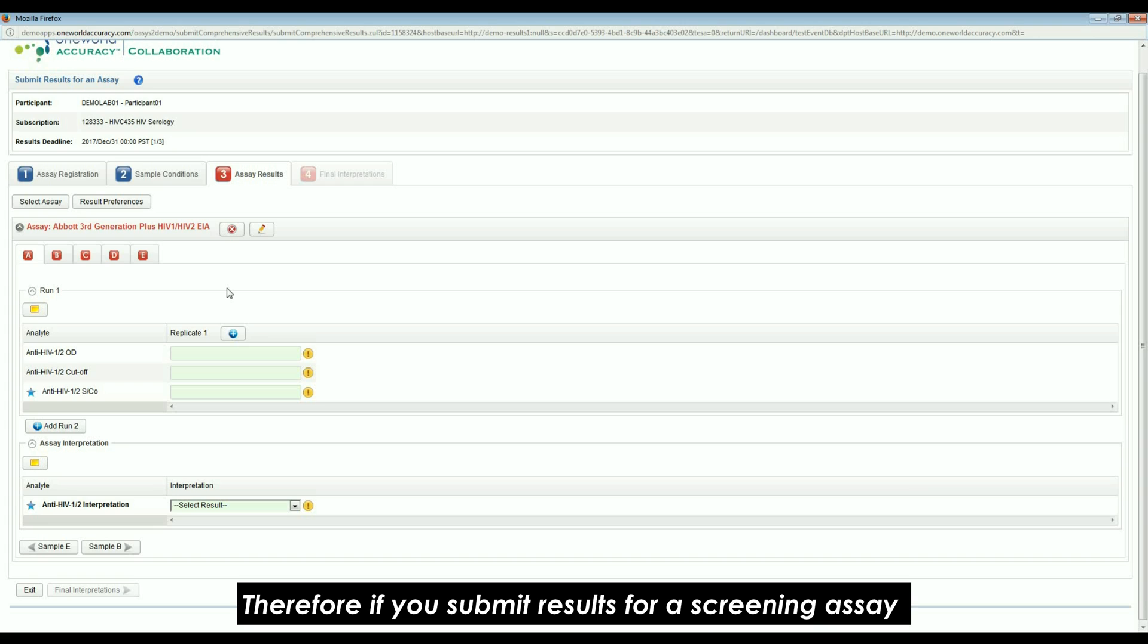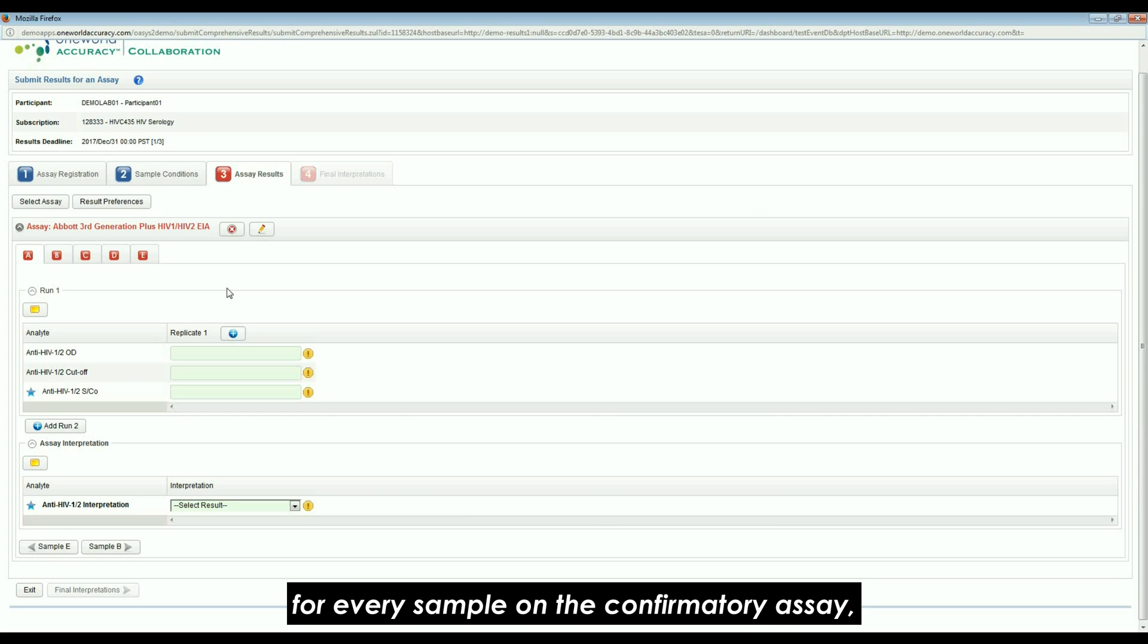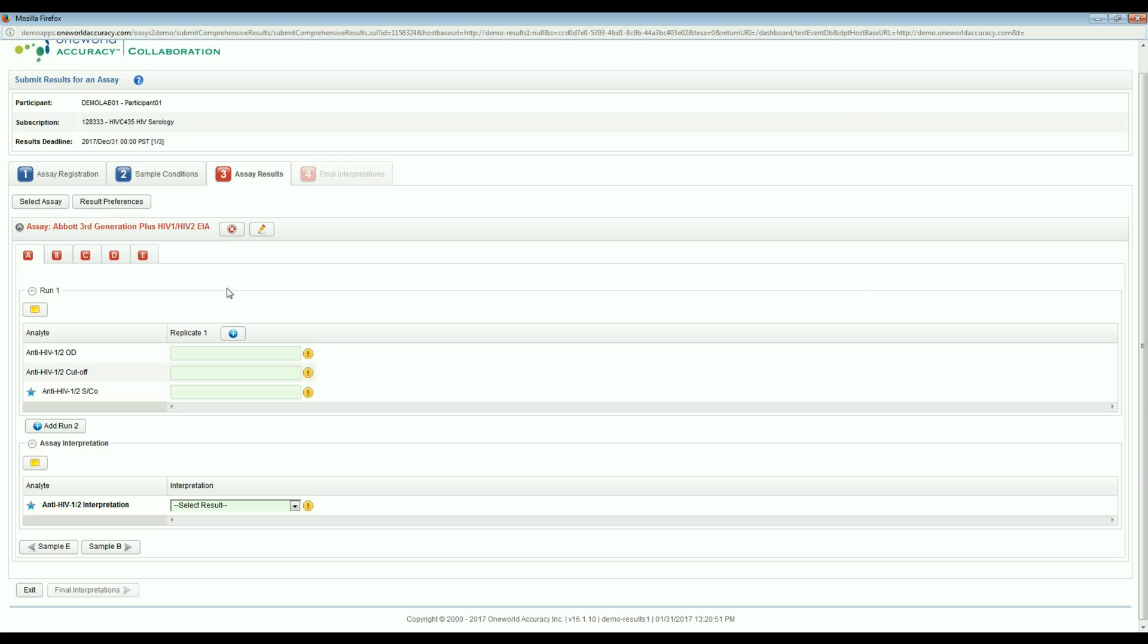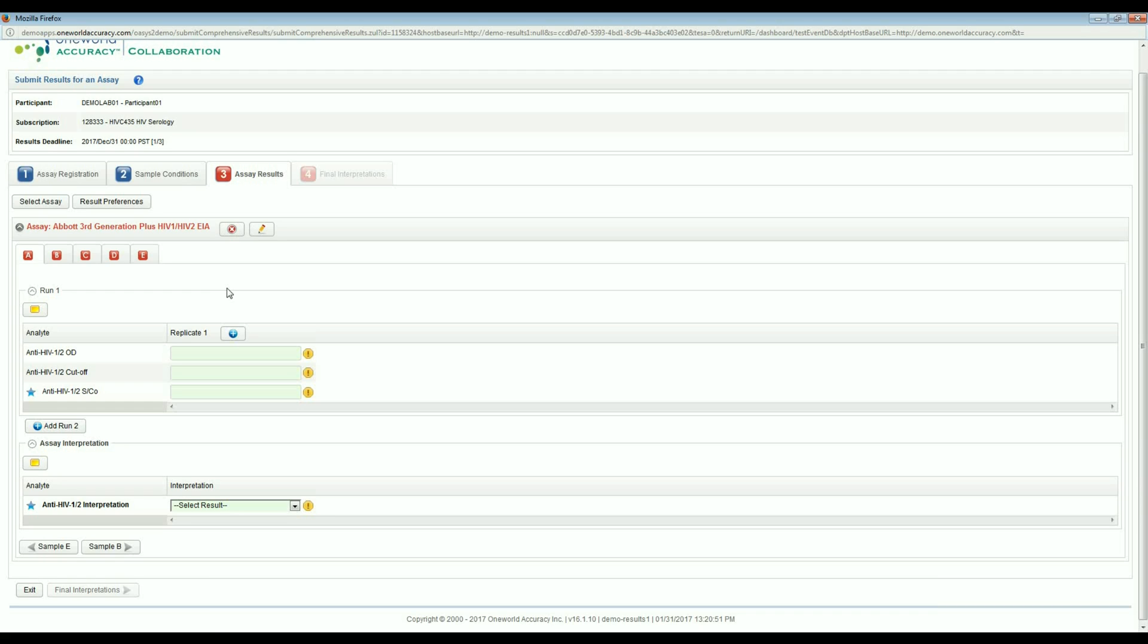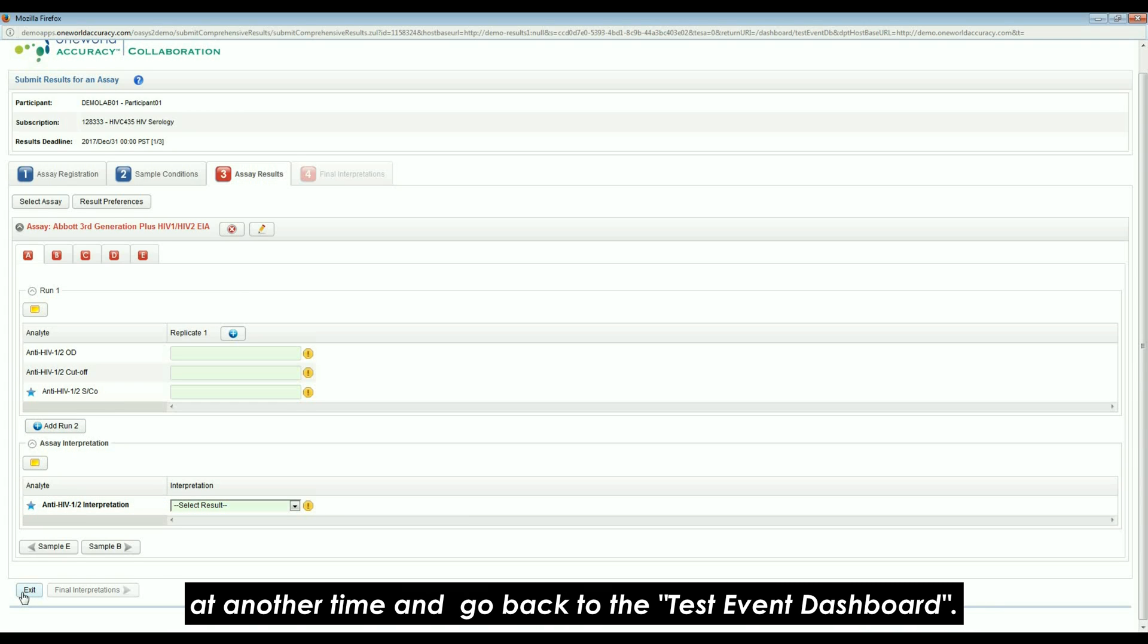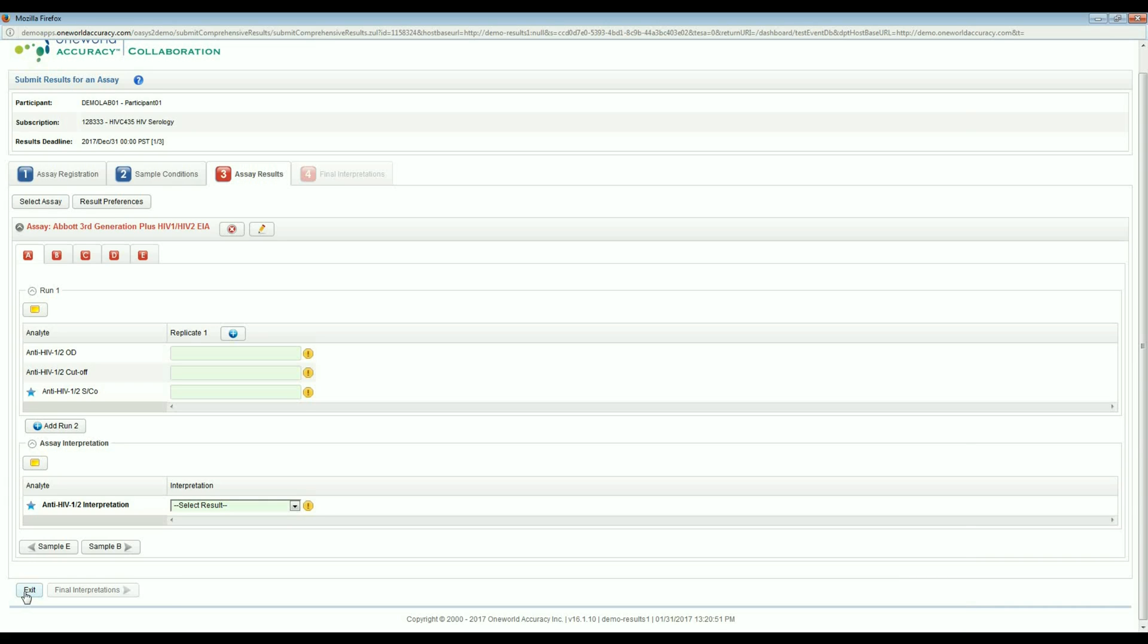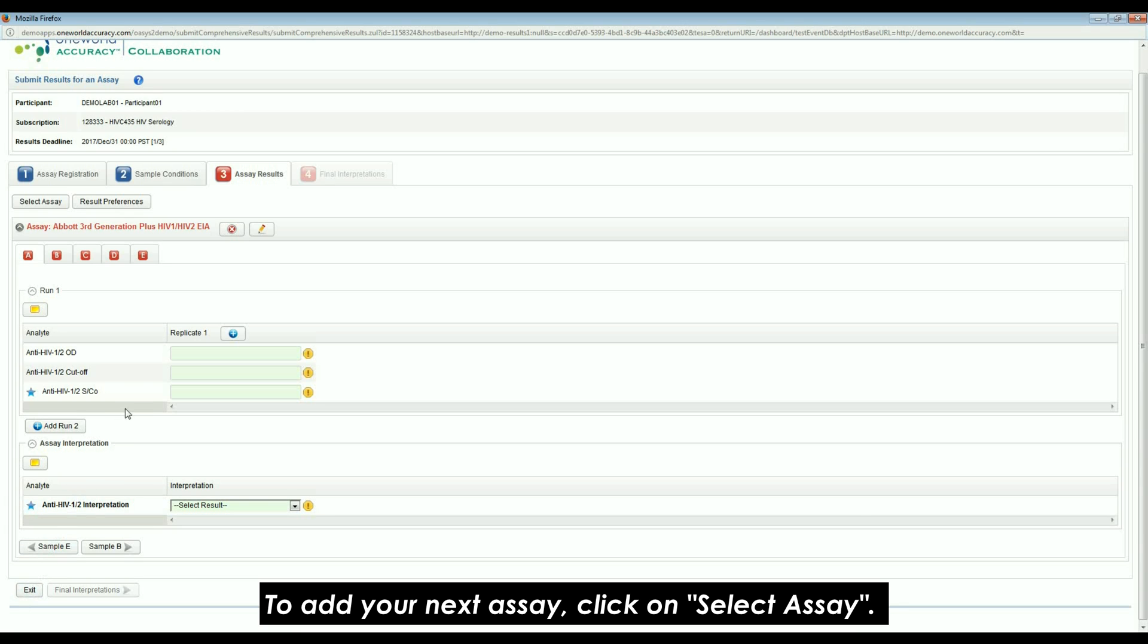Therefore, if you submit results for a screening assay and a confirmatory assay, it is not necessary to submit results for every sample on the confirmatory assay. The same is true for your additional runs and replicates. Press Exit if you want to finish the process of submitting results another time and go back to the test event dashboard. Complete these steps for each assay used. To add your next assay, click on Select Assay.